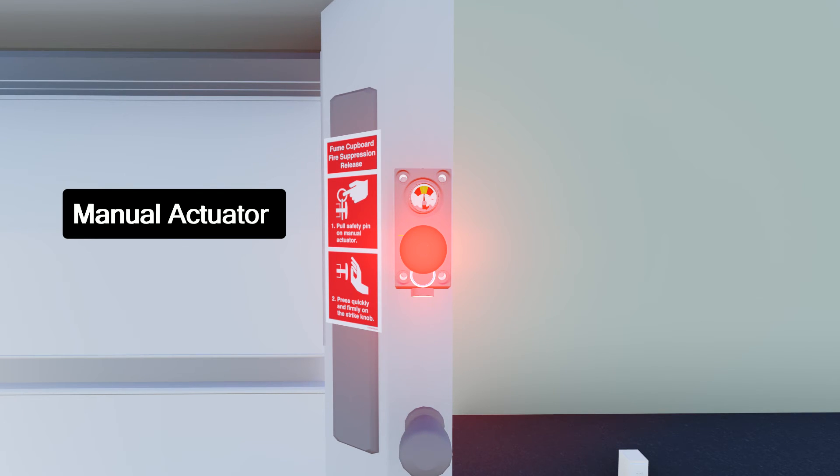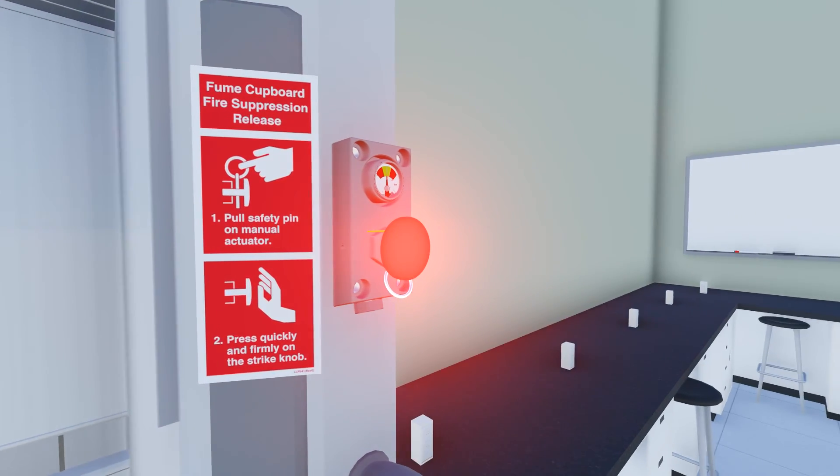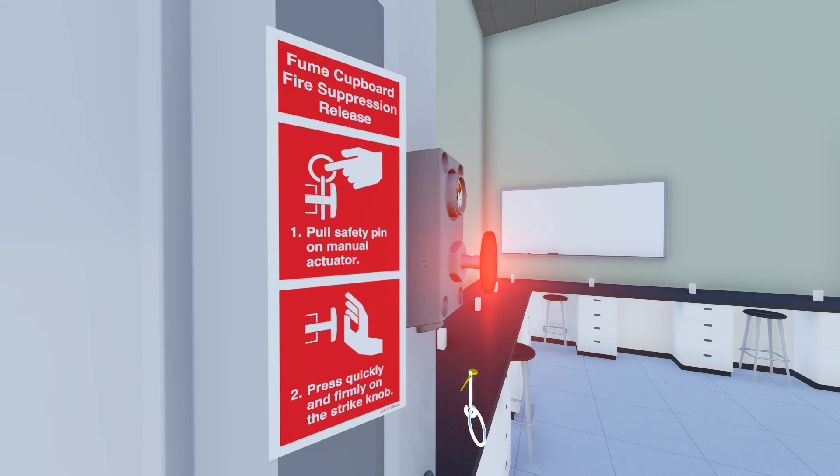An optional manual actuator can be supplied to discharge the system prior to automatic actuation. This is done by removing the pin and firmly striking the red button to release the pressure in the tubing.